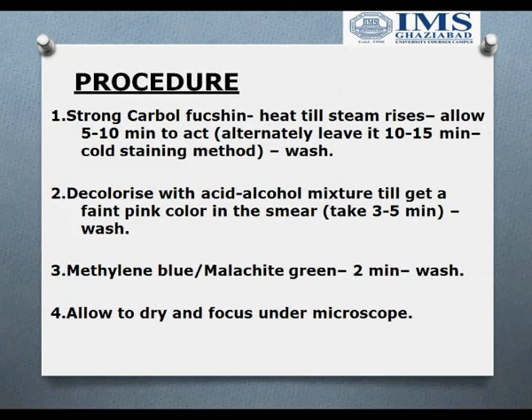Procedure. First we have to prepare the smear. Now you easily know how to prepare a smear. Then we will add strong carbol fuchsin. Then after adding carbol fuchsin, we will heat it till steam rises. When we see the steam, we allow 5 to 10 minutes to act, or we will wait.